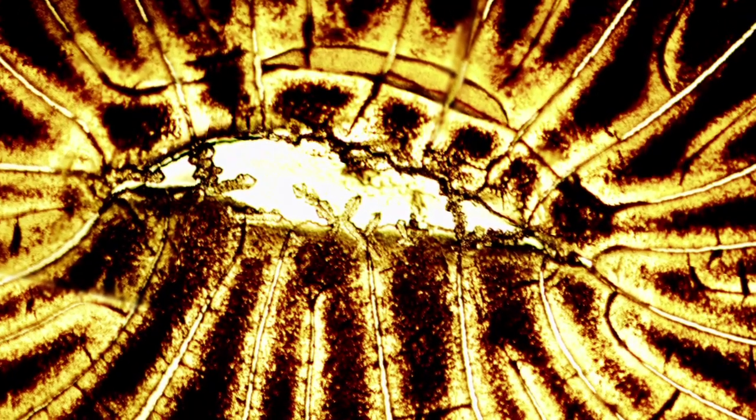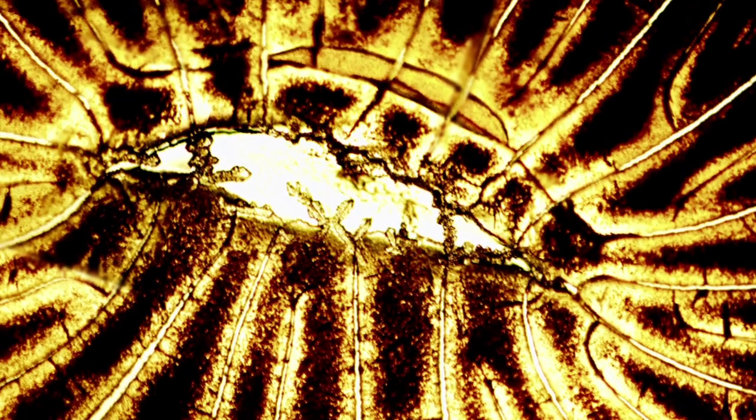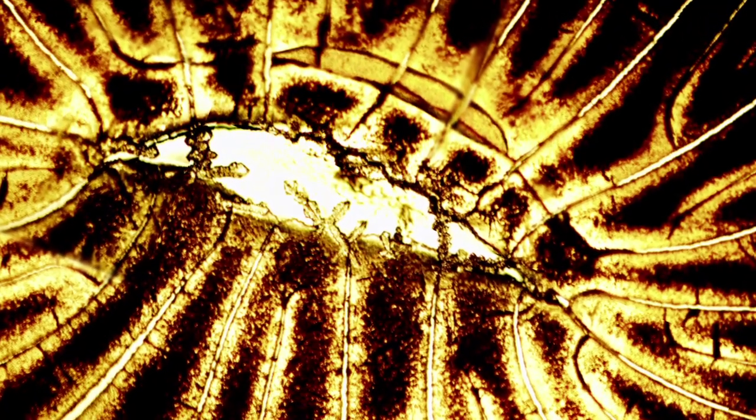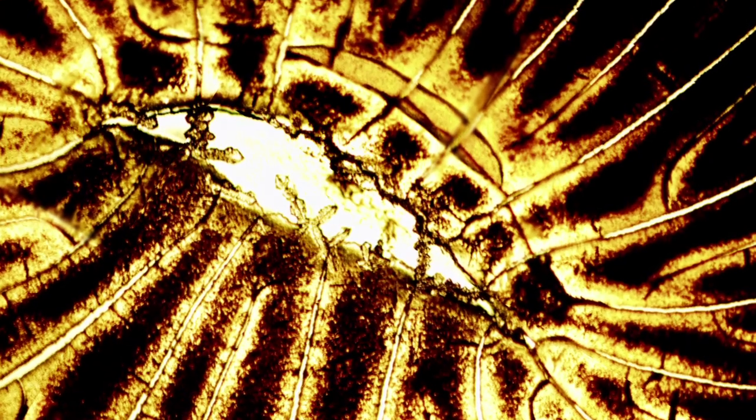This image was taken with an optical microscope and shows a dried and cracked film of a waxy material called alkyl-ketene dimer, or AKD, spread over a glass microscope slide. The orange and brown areas you see are AKD and the white lines are the cracks that have formed during drying.